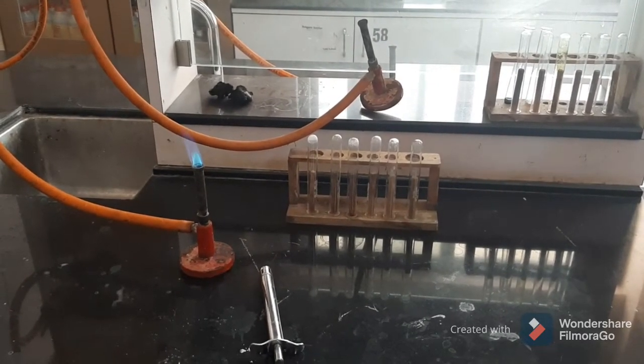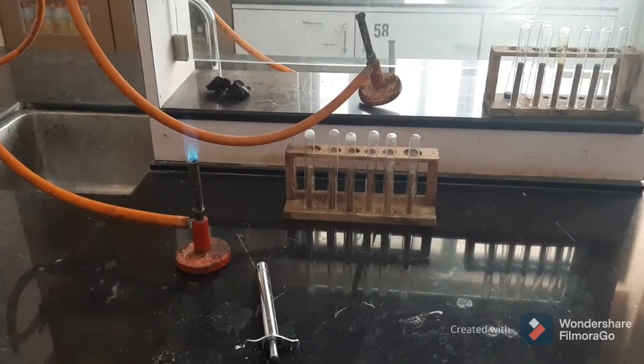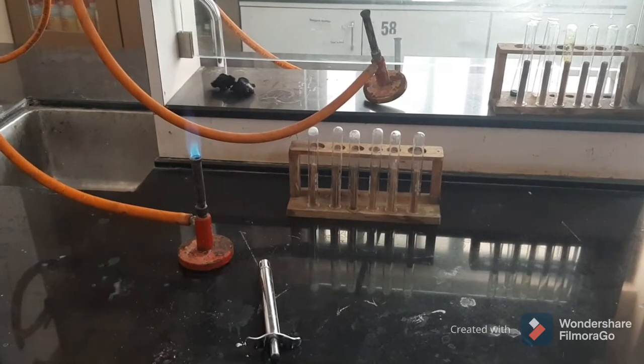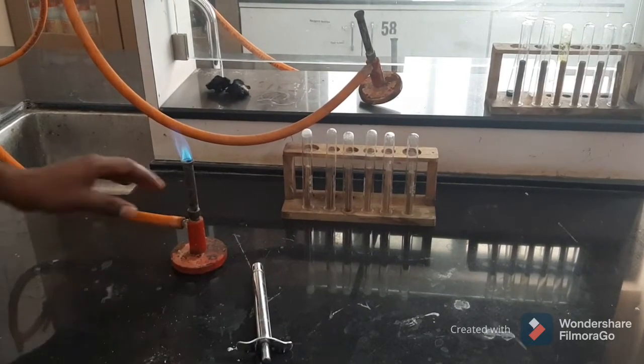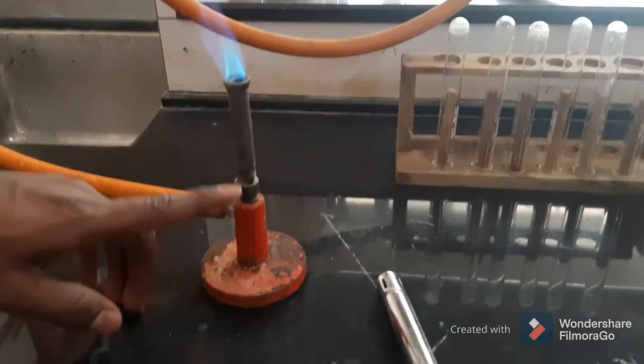Today we are going to study experiment number 2: basic chemistry laboratory techniques. We are going to study the Bunsen burner. This is a Bunsen burner — it consists of a metal tube with a bore at the base.